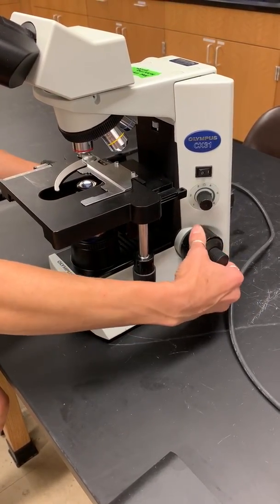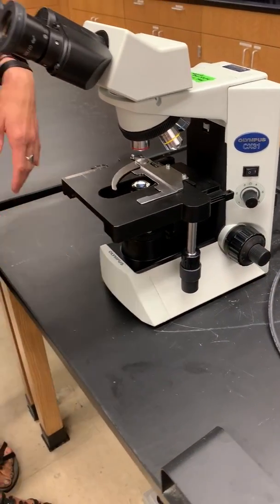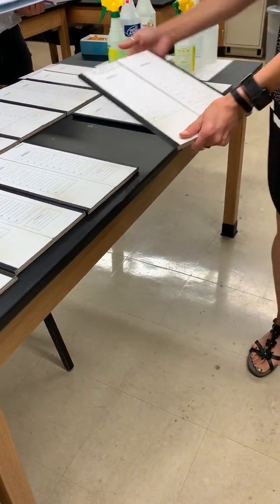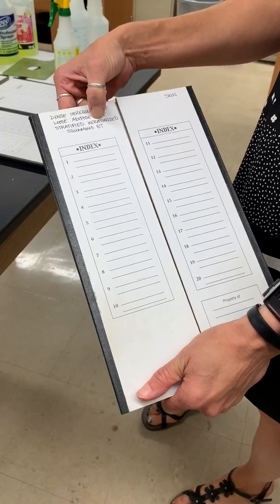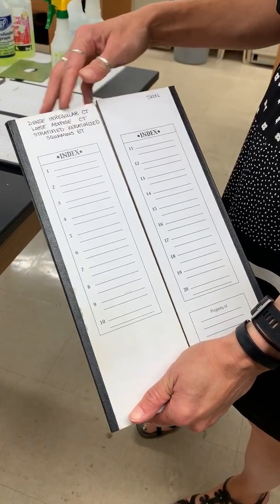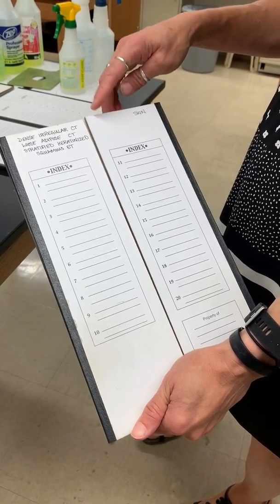We always want to put our stage all the way down before we put a slide on. We've got all our slides laid out in these folders. When you open them up, they've got on there dense irregular connective tissue, loose adipose connective tissue, and stratified squamous keratinized epithelial tissue. All of these tissue types are going to be visible on one of these slides because they're slides of the skin.